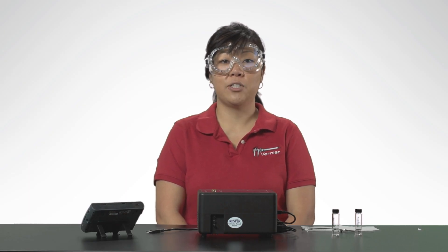The Mini-GC Plus can detect and distinguish between families of compounds such as alcohols, ketones, esters, and halogenated alkanes.